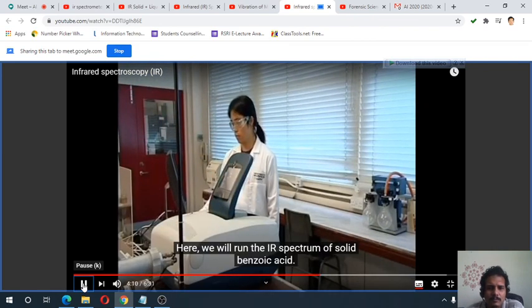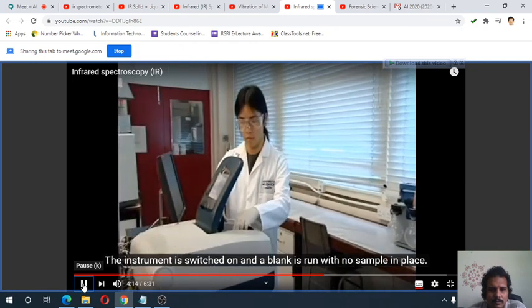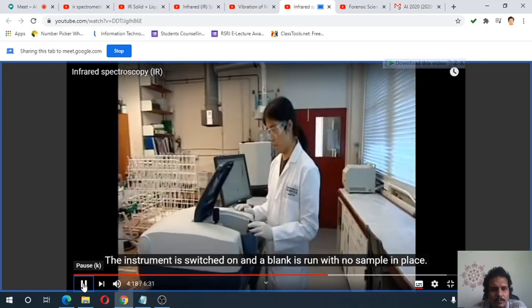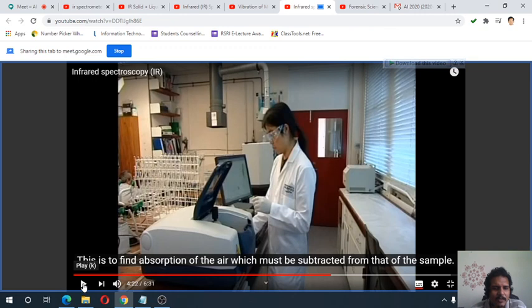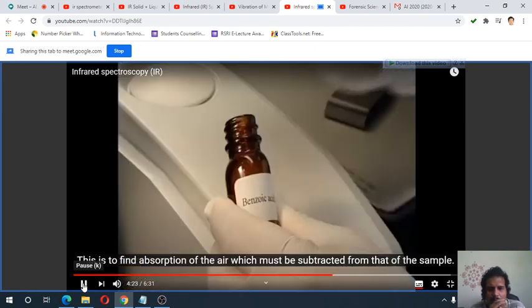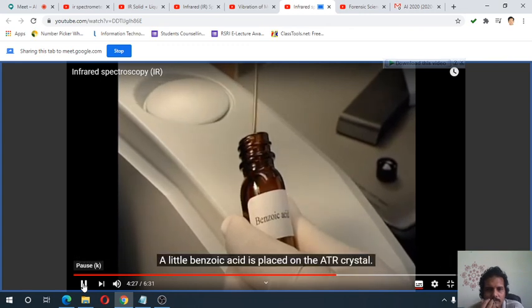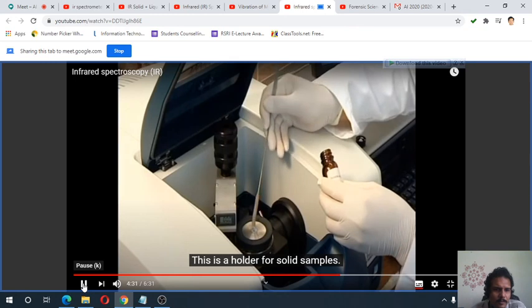Here, we will run the IR spectrum of solid benzoic acid. The instrument is switched on, and a blank is run with no sample in place. This is to find the absorption of the air. Okay, so that is to record the background noise. First they will record it without any sample, which must be subtracted from that of the sample. A little benzoic acid is placed on the ATR crystal.